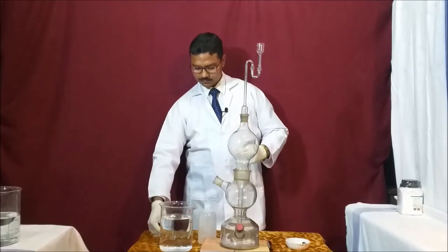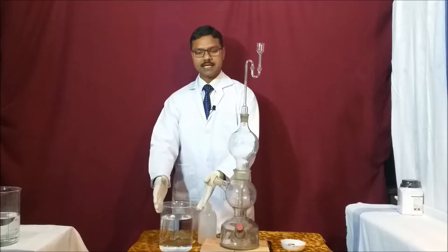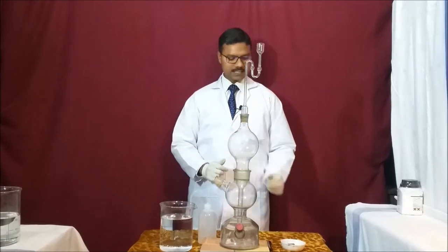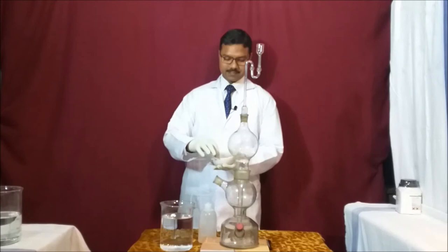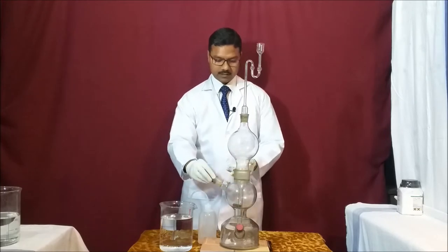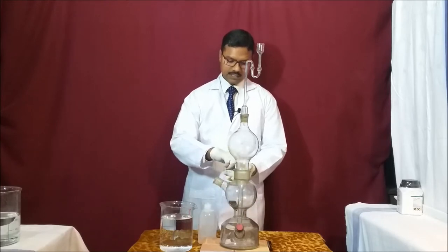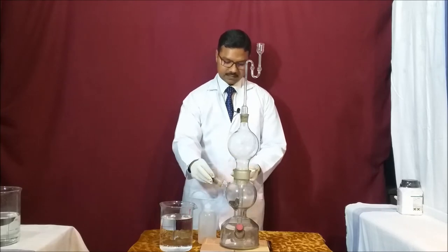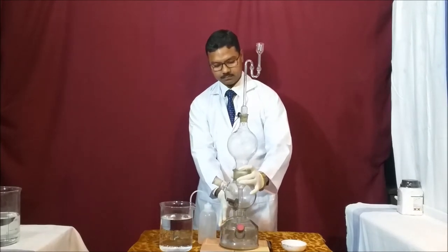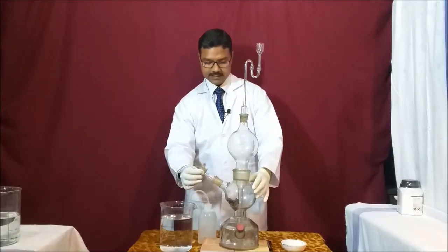Now I have here a few samples of iron sulfide, and in this big beaker we have dilute sulfuric acid which we will introduce into the Kipp's apparatus after introducing the iron sulfide sticks. I am slowly introducing iron sulfide into the apparatus, and you can see all the iron sulfide is stuck here. This is how iron sulfide goes into the apparatus.